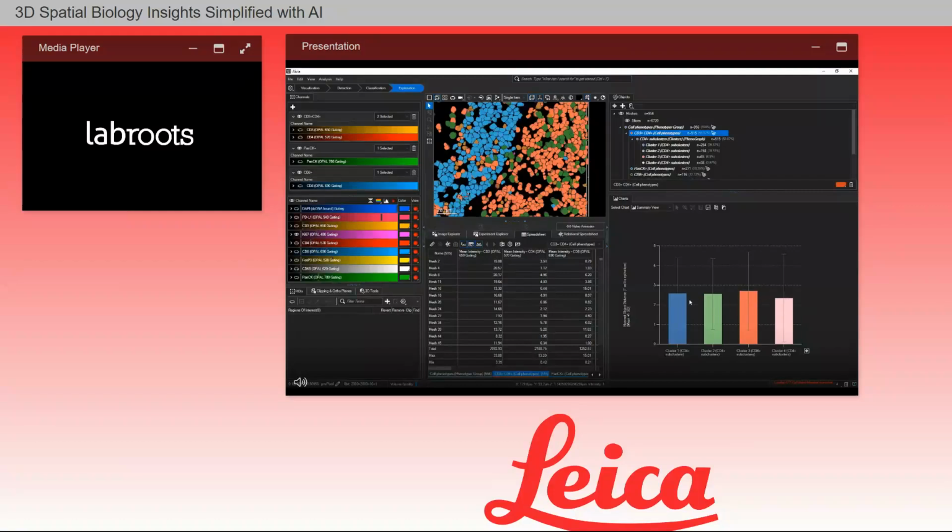So with a larger image, this may be an interesting hypothesis to test whether this type of CD4 cells from cluster 4 may be influenced by the proximity to the epithelium, using the measurements that are available in Aivia. Let's look at the intensity distribution of the CD4 channel for these subclusters. In charts, go to violin plot, and I'm going to select mean intensity of CD4 on my axis.